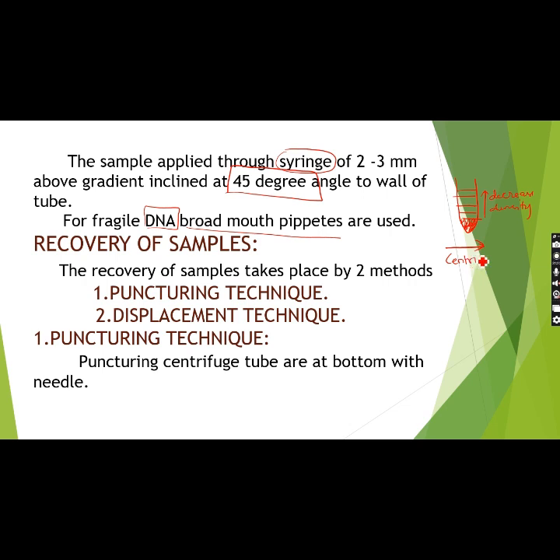The centrifuge tube with the sample is going to undergo centrifugation, where a fixed centrifugal field is applied. There is no change in the centrifugal field. After the centrifugation, the sample components are going to be separated based on their density.